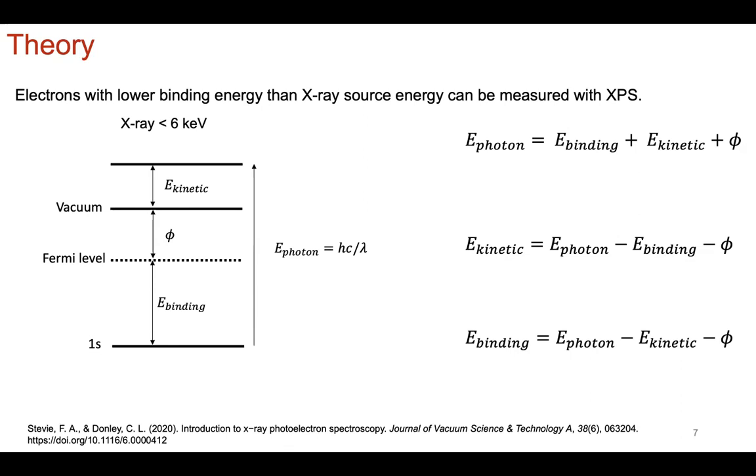But that's not to say that overfitted spectra haven't been published before, so you should do it with a lot of caution. Okay, that's my diatribe on don't overfit your spectra.